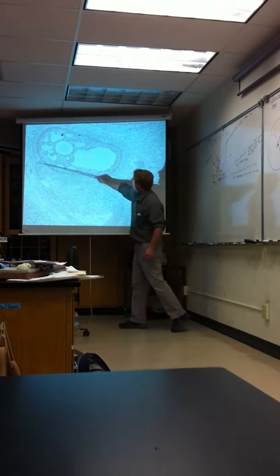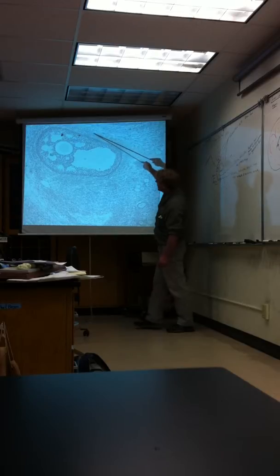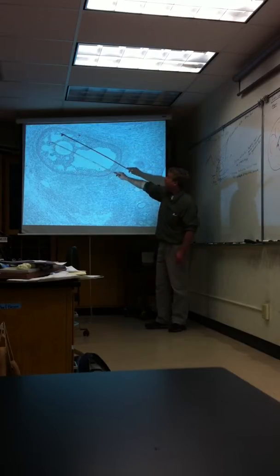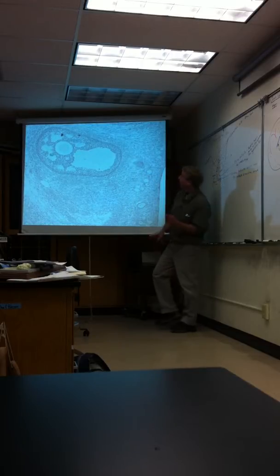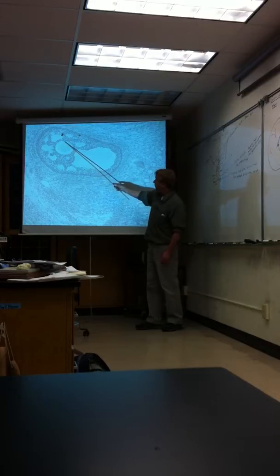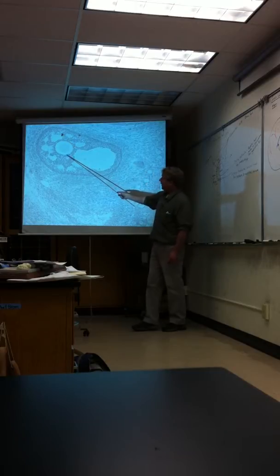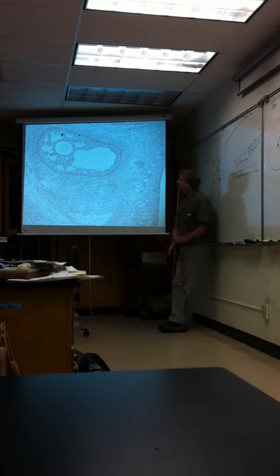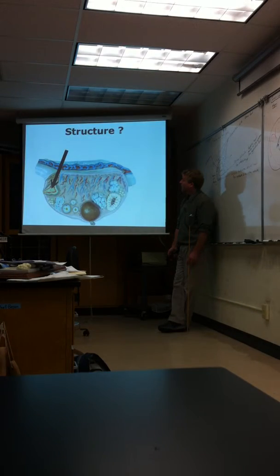This whole thing is a secondary follicle, including the theca folliculi. And so the entire thing is a secondary follicle. Make sure everyone has it. What is this cell? Primary oocyte. Good. And so it's a primary oocyte. And this white layer, good one, is zona pellucida. And so you can see the zona pellucida being made. The cellular layer is corona radiata. Excellent.